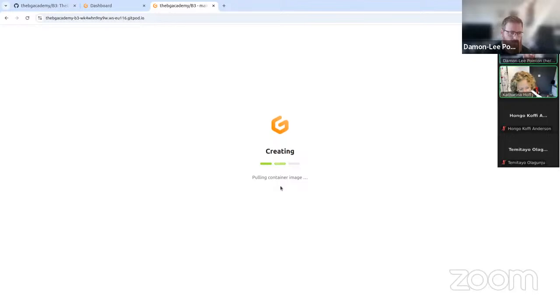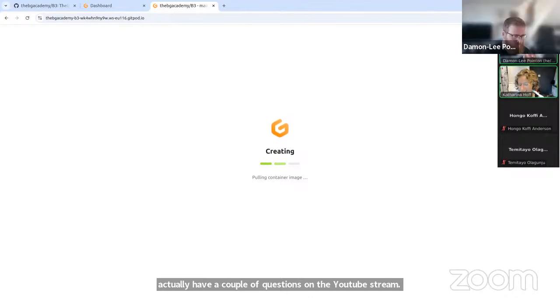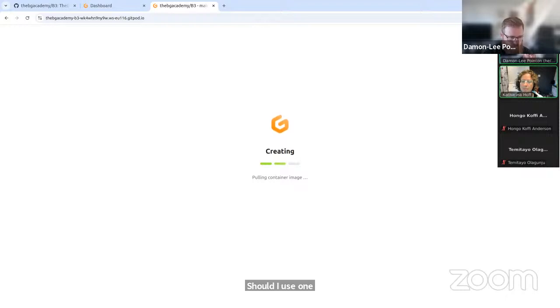You actually have a couple of questions on the YouTube stream. Okay, I don't see them. Can you read one? Yeah, sure. So this is from Mohammed Salman. Question 1. I have Illumina paired end RNA-seq data from 3 tissues, the head, thorax, and legs of the same species. Should I use one RNA-seq sample or merge aligned sorted BAM files with HISAT or BRAKER3?